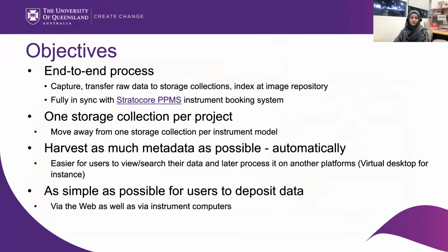Okay, so the main objectives of this project were, we did a big analysis with the buildings and networking. With the networking, we had, at buildings, the custodians of instruments. So after doing all those things, the first thing we dealt with is the networking issues, because each building had a different network setup.